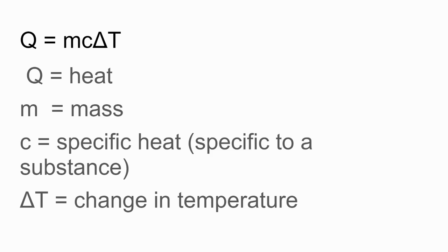Okay. So this is going to be our calorimeter for today. So just be aware. I've cut a hole in this pop can, and I've tried to fold most of the edges over, but especially the top is pretty sharp. So be really careful when you're handling this. This can cut you. Okay, so just be cautious when you're moving this.